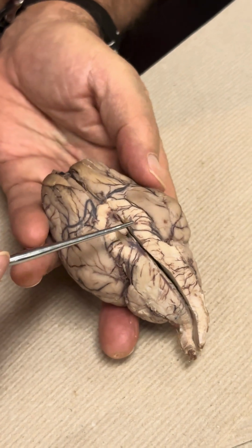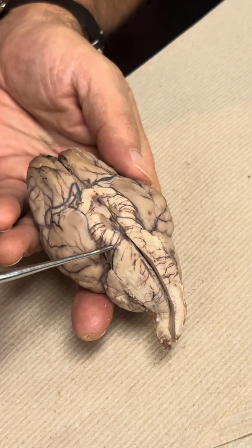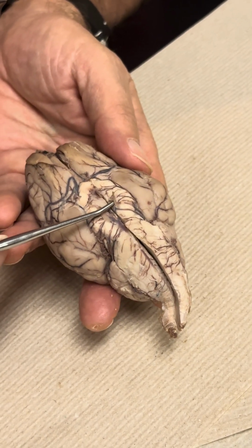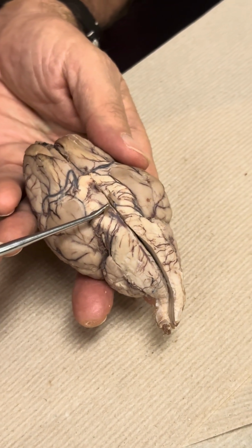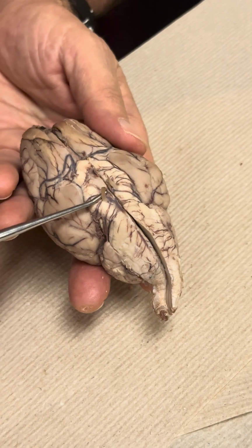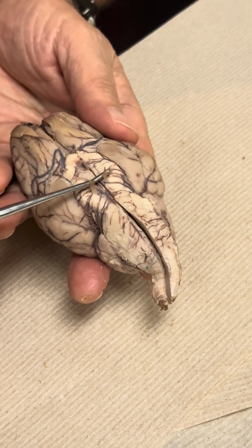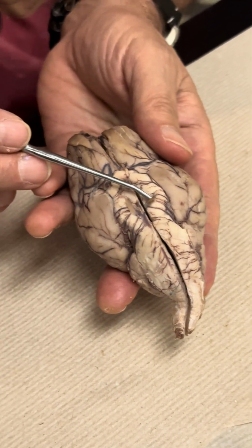Okay? So our two columns of white matter here are the cerebral peduncles. We have one and two of cranial nerve number 3, oculomotor, coming right off the cerebral peduncles. So both of those are cranial nerve number 3. Yes, both of those are oculomotor.